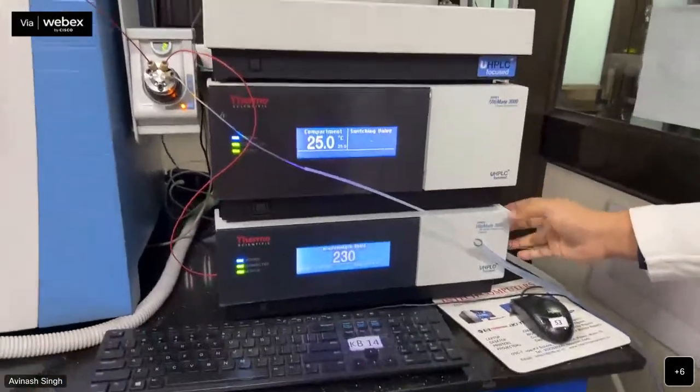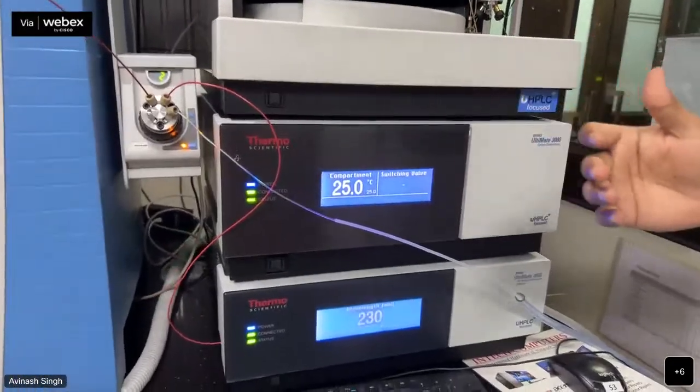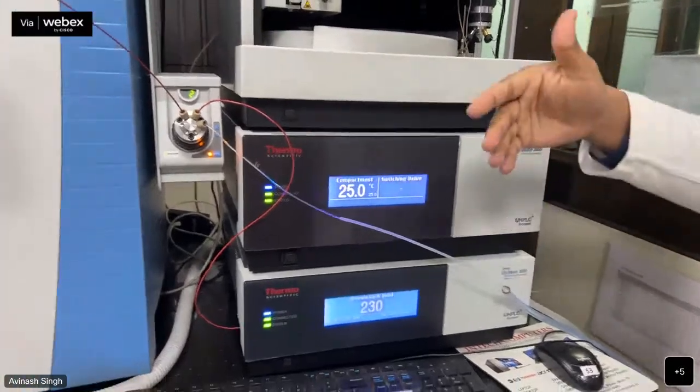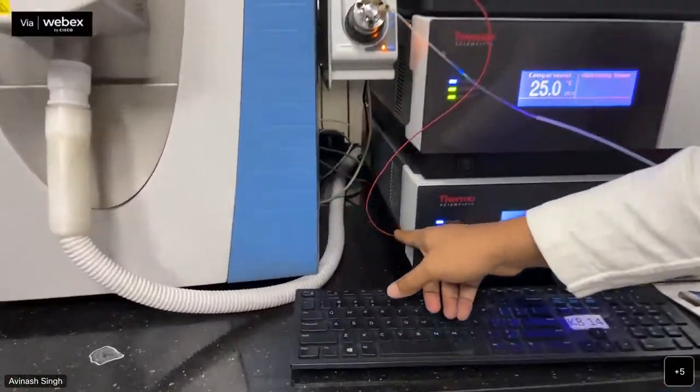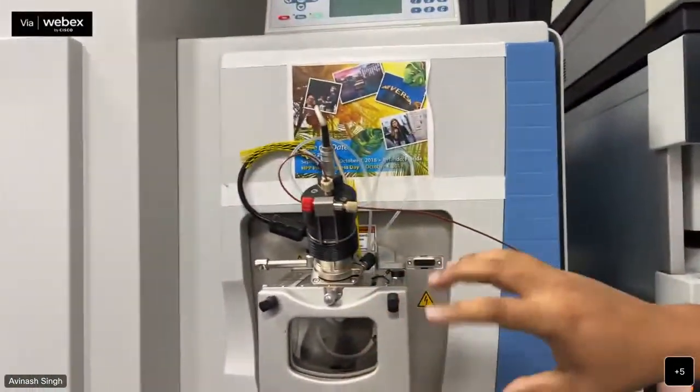And this is the UV detector compartment, where we detect different molecules as they pass through, giving different UV spectra and absorbing the spectra of the particular small molecule. After that, from this compartment, the sample goes to the mass spec, and all the analysis will happen there.